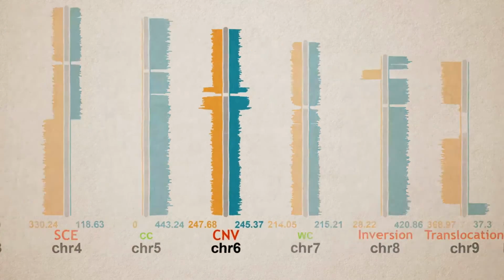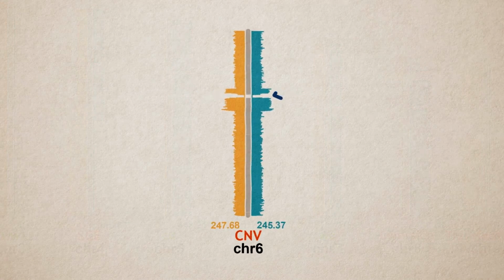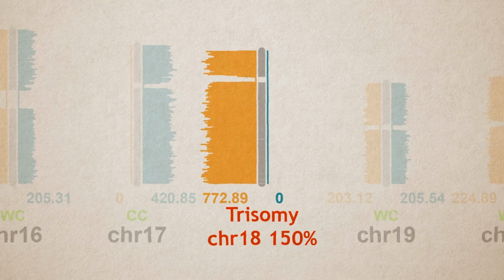Strand-seq can also be used to detect chromosome copy number variations across the genome. It is also possible that chromosomes are not evenly divided over the daughter cells, resulting in a cell containing, for example, 3 copies of chromosome 18, trisomy.